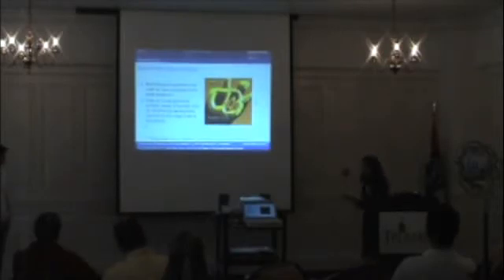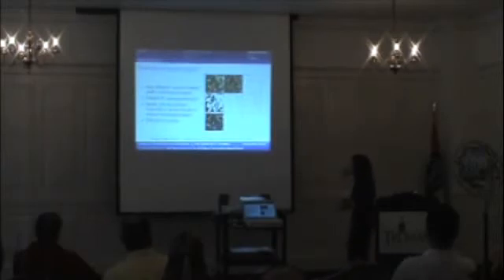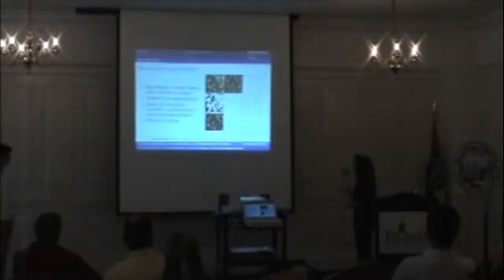I think it kind of gives me an idea here, but I'm sure there's examples. This is usually a very efficient method, and it will always yield continuous regions. Although without planting seeds or markers to start flooding, you always get an over-segmentation problem, but it can be easily avoided. So seeds can be planted. Like I said, we can usually see the nucleus of each image, so we could use that potentially as a seed, or we could manually plant it.